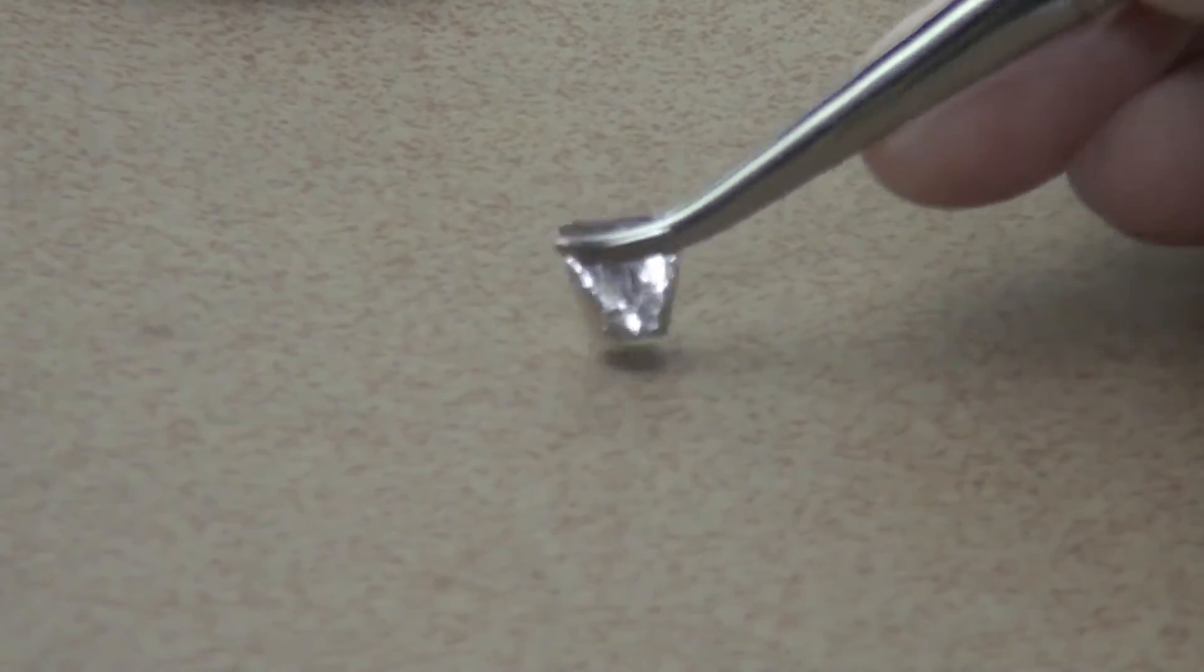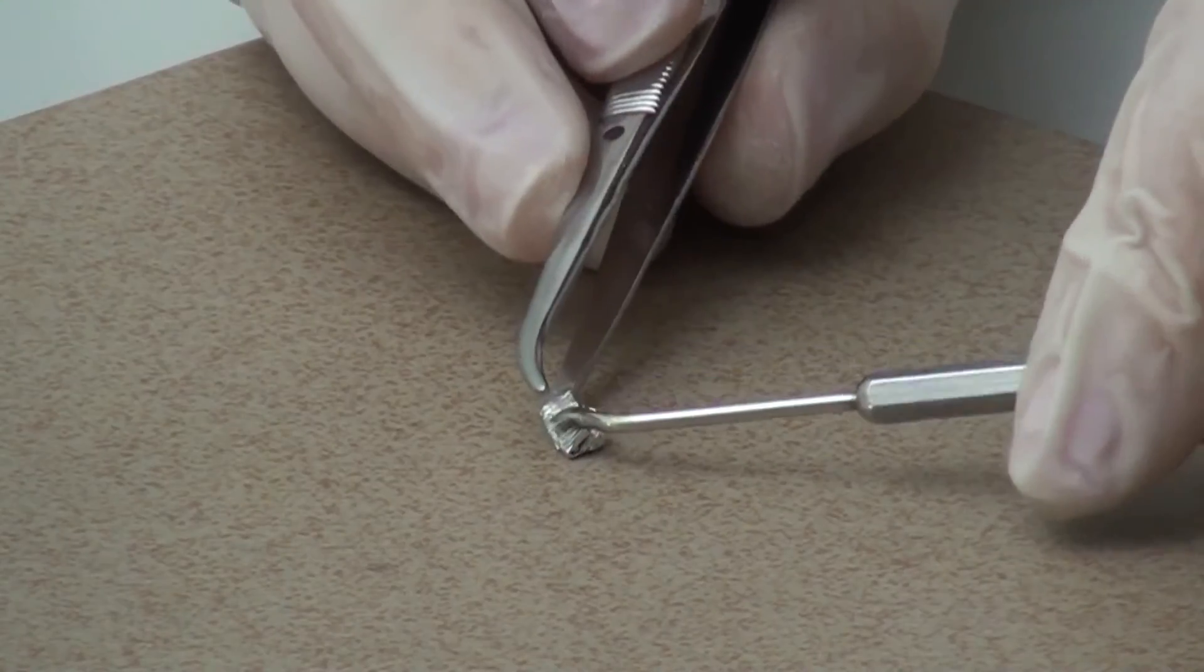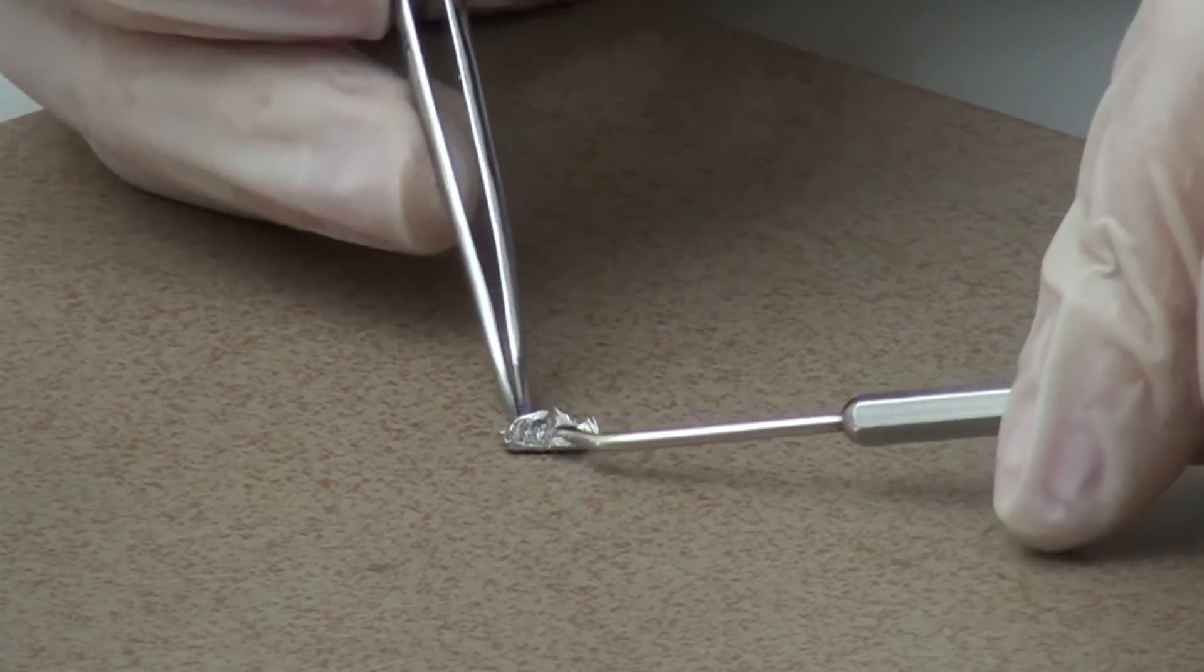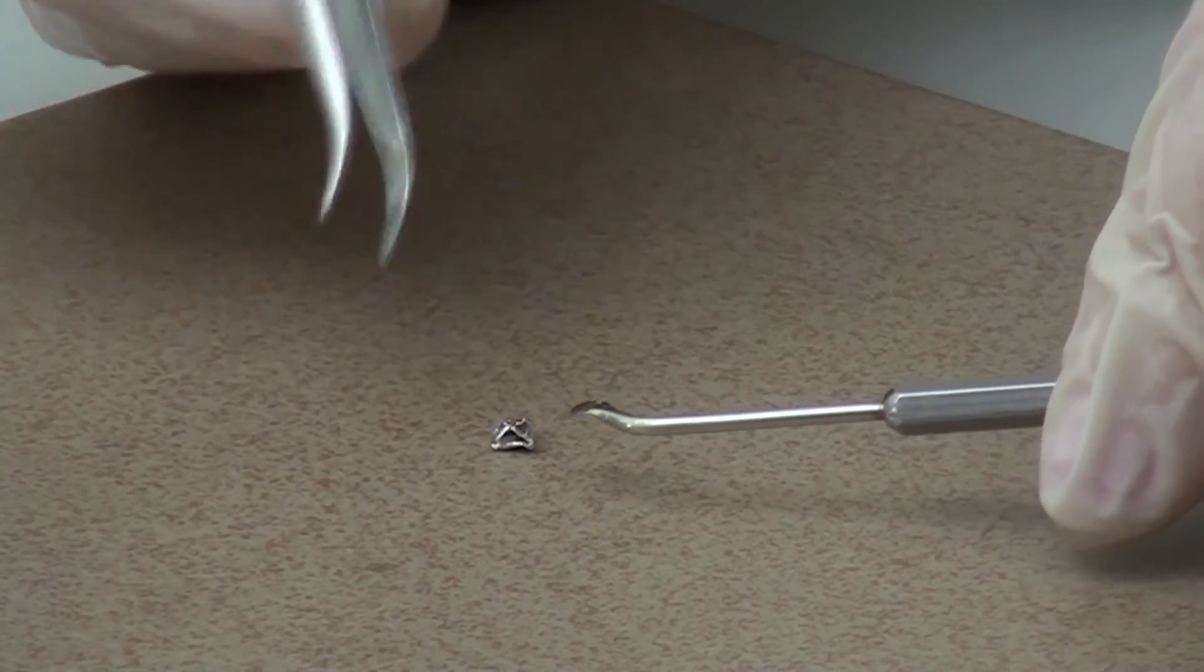The aim in folding the capsule is to form a little package that won't leak sample and has no little fins of metal sticking out that might catch in the auto sampler.